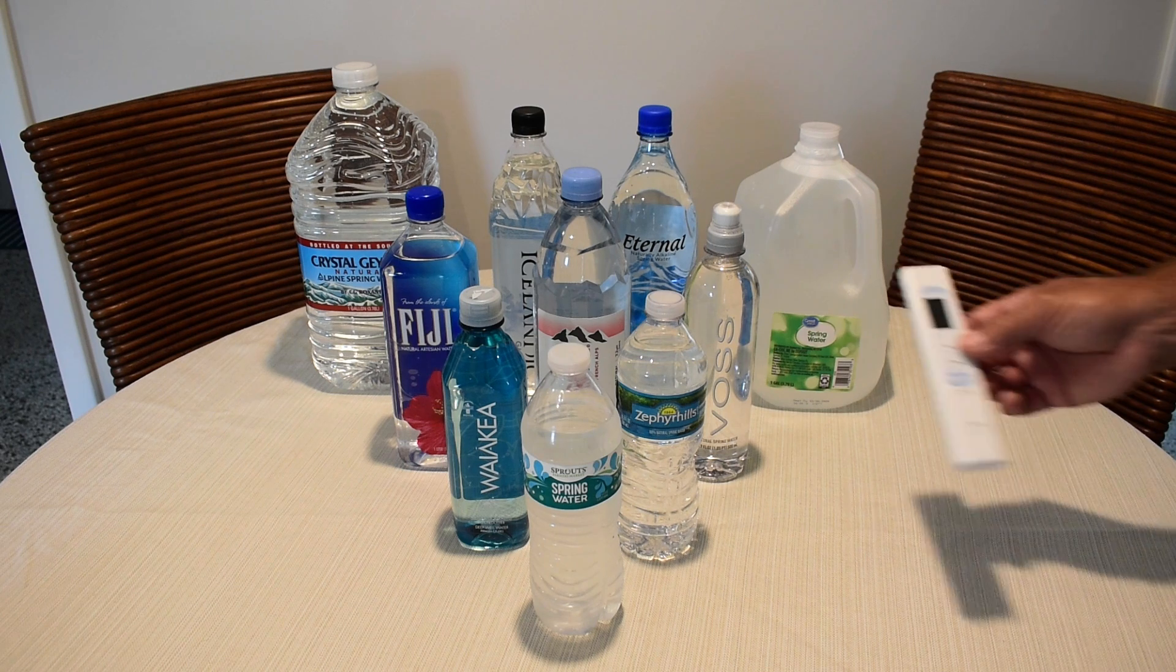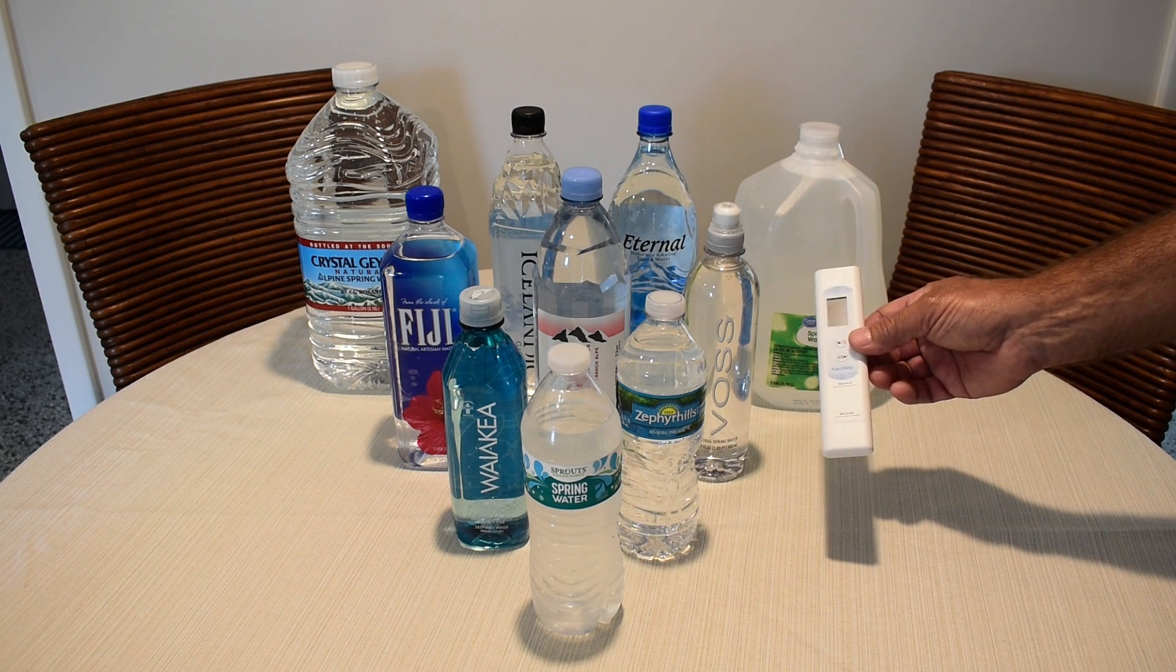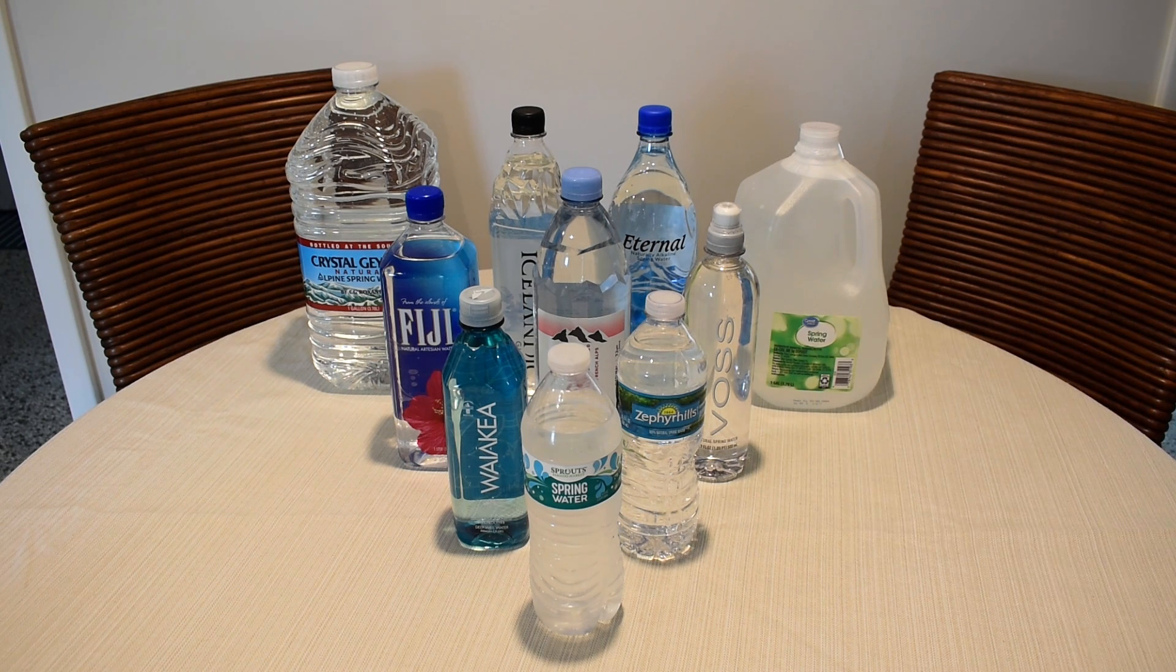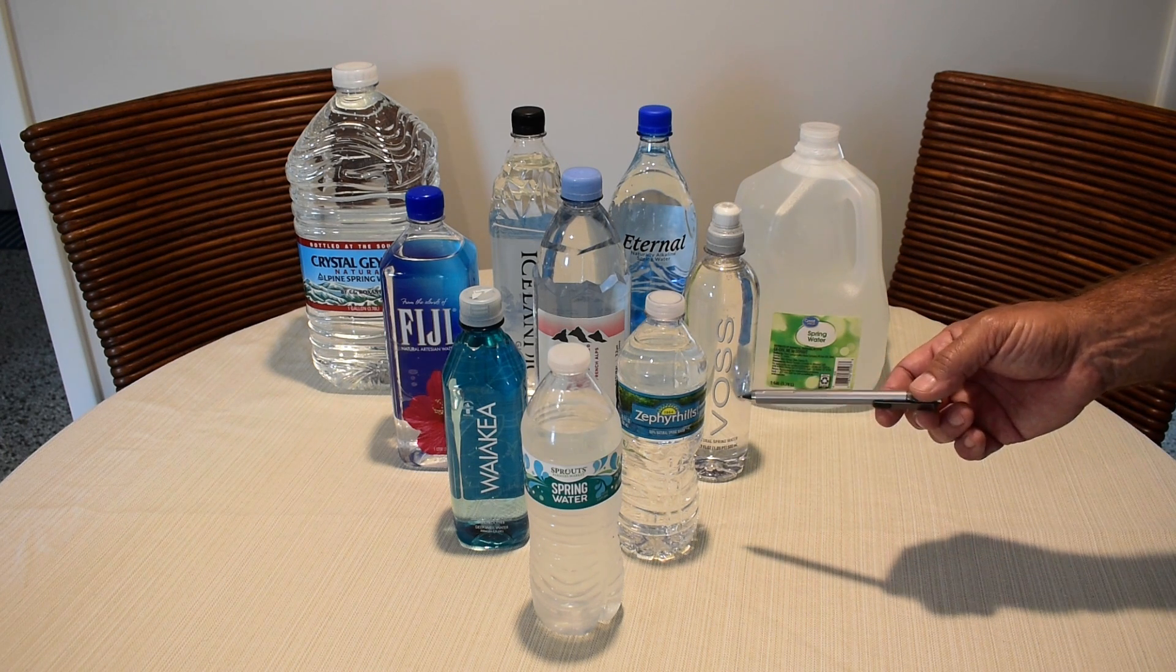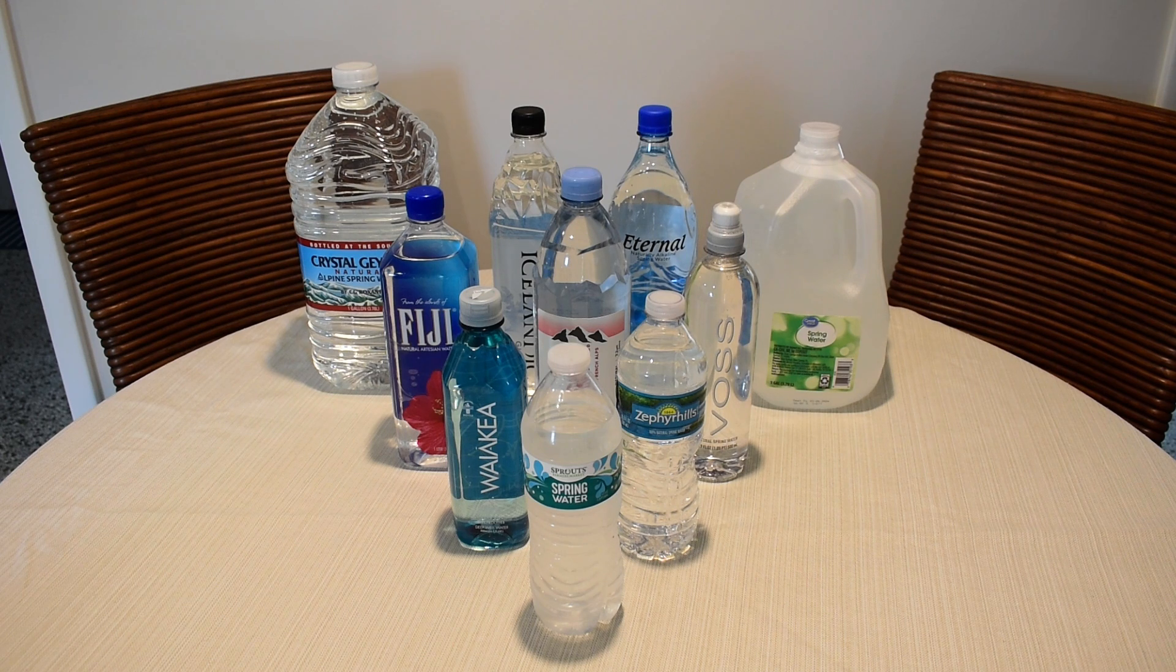I'll be using this brand new calibrated 6-in-1 water analyzer. We will not be testing any RO purified bottled drinking water in this video, because that type of water should be free of contaminants.